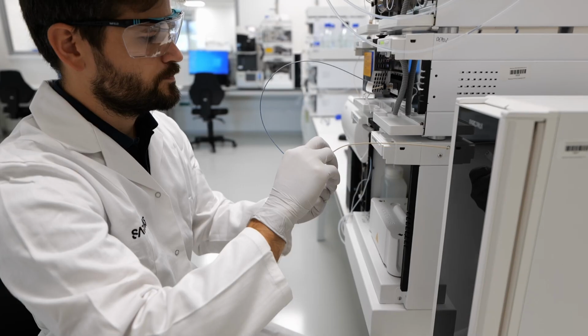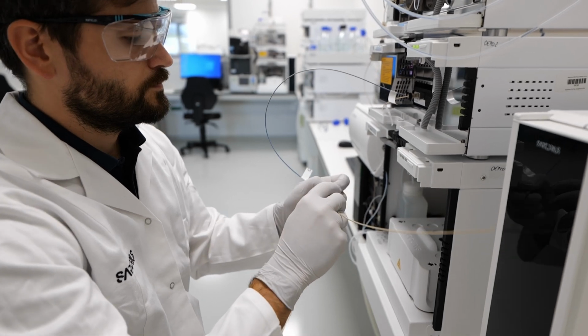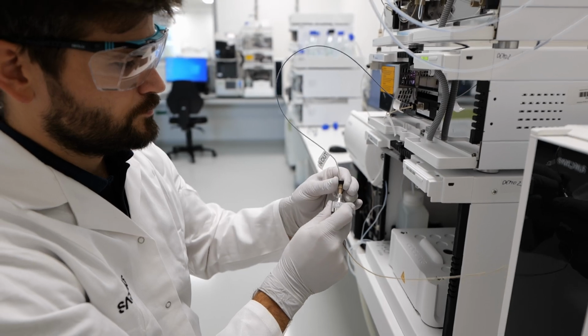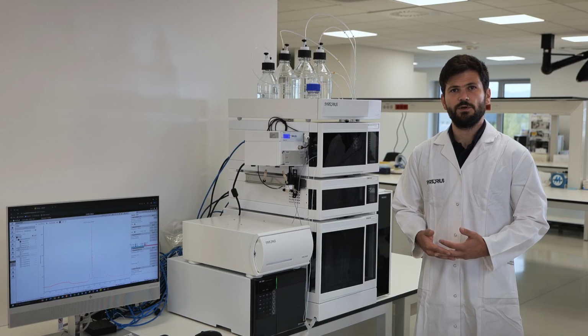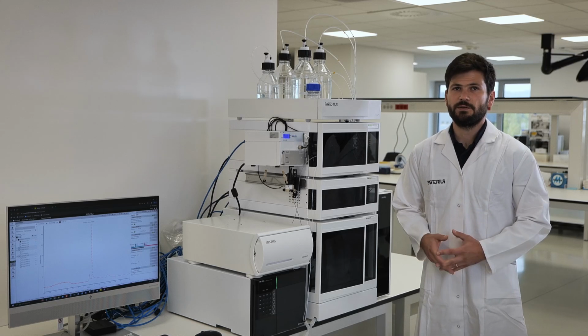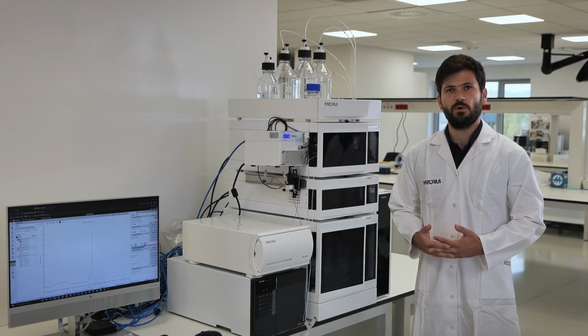By analyzing the starting material, such as cell lysate with UV fluorescence and multi-angle light scattering detectors simultaneously, it becomes much easier to adjust the downstream process steps to the quality of the starting material. Likewise, requirement ranges can be put in place to ensure only material with sufficient quality proceeds further downstream.